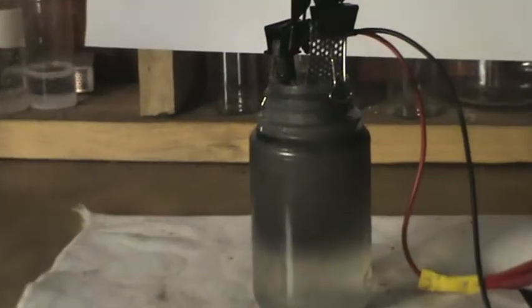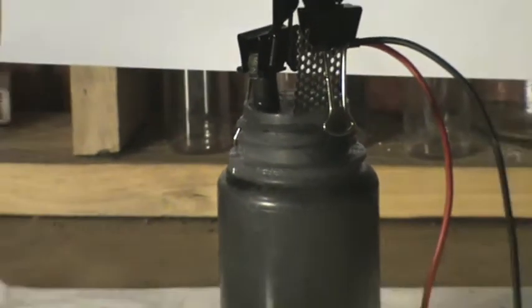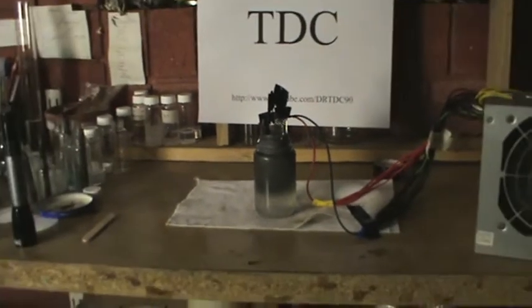Welcome TDC viewers. In this video I will be pre-treating a graphite electrode for lead dioxide electrodeposition. Pre-treatment of graphite or any other material prior to electrodeposition is necessary because we want an adherent deposit to form on the substrate.